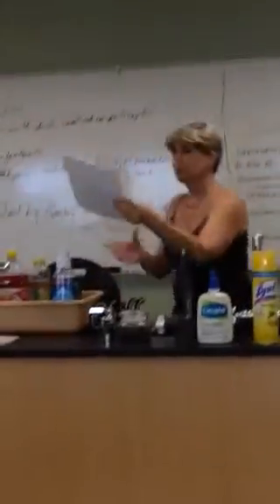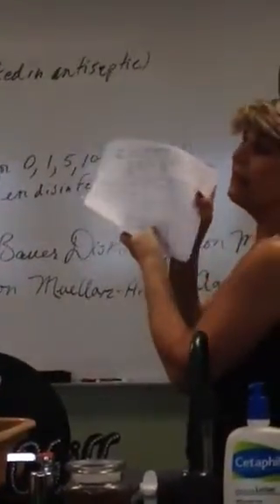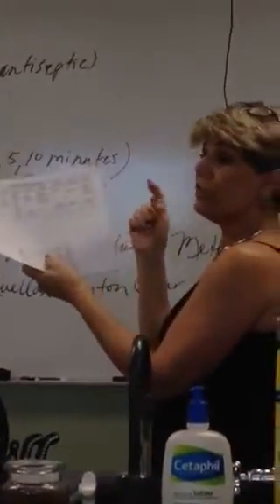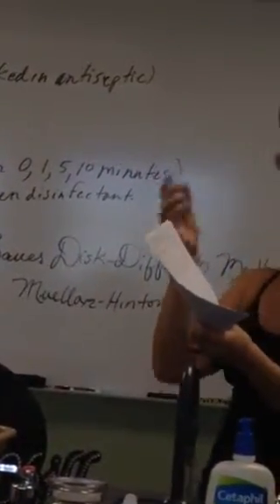Then I have to go to the chart and look for ampicillin. It's right at the top, and it says resistant is 11 millimeters or less than 11 millimeters. So there's a zone of inhibition, but it's not big enough for the bacteria to be considered sensitive to it.